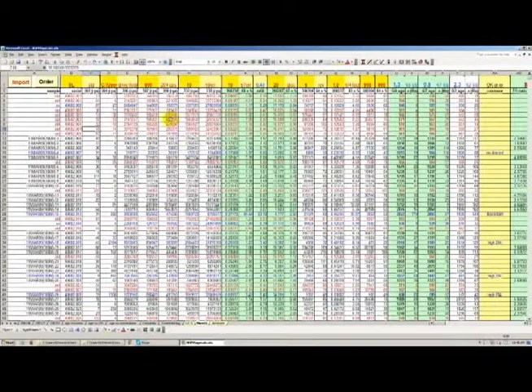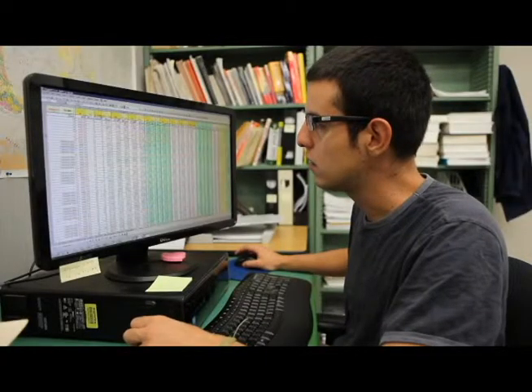So as I told you before, once you type $X in the labeling of an individual grain, this line is going to turn blue, right? Because there's a filter in the macro that is telling the program that if there's anything here labeled $X, it's going to turn blue. And if you look at analysis number 4 down here, the whole line is blue. That is because we have some thresholds that are being applied to the data to just filter or highlight the problematic individual analysis.